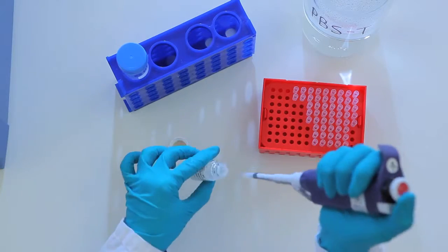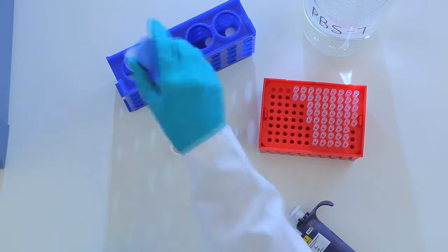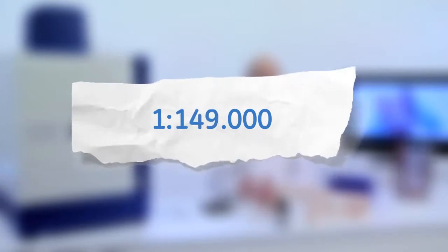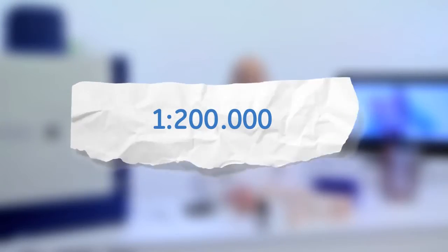After incubating the membrane in the primary antibody for 1 hour at room temperature, the membrane is incubated in an appropriate HRP labelled secondary antibody. When using ECL Prime, the secondary antibody can be diluted in the range of 1 to 50,000 to 1 to 200,000. Now we can think about detection.